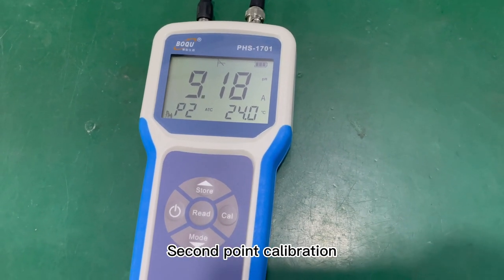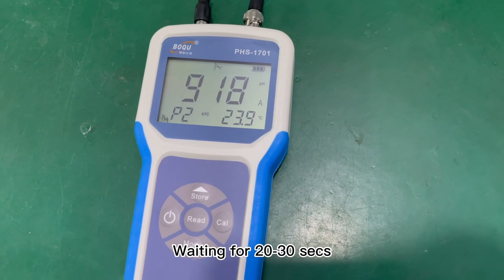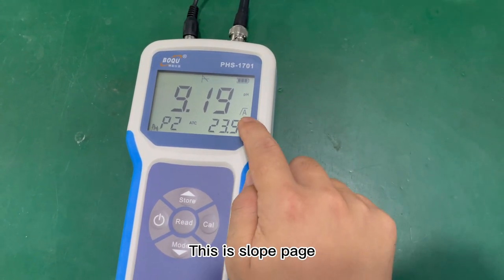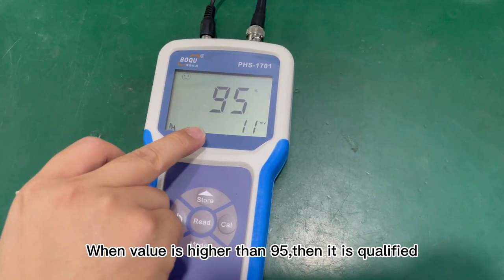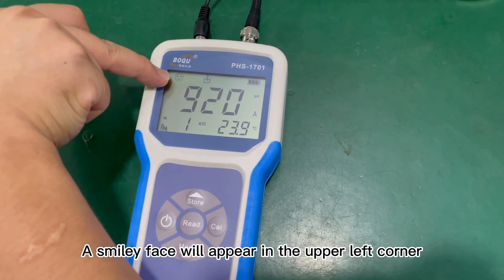Second point calibration — P2 is displayed in the lower left corner. Wait 20 to 30 seconds, then press ENTER when the value appears. This is the slope page. When the value is higher than 95, it is qualified, and a smiley face will appear in the upper left corner.